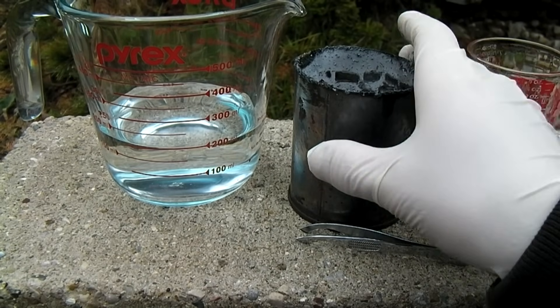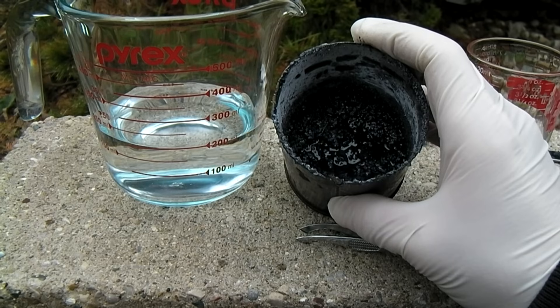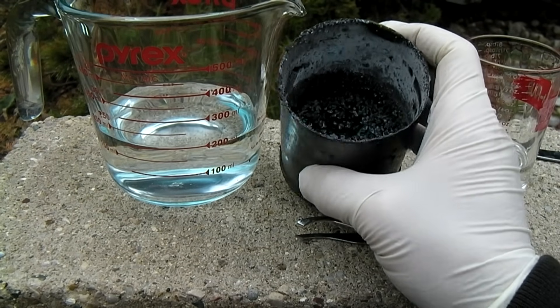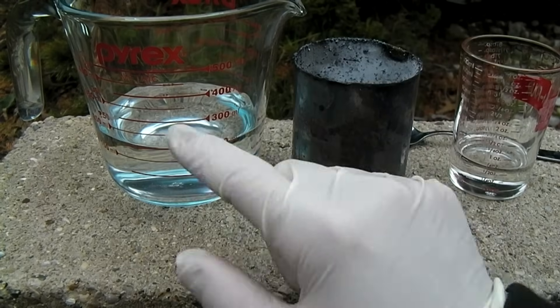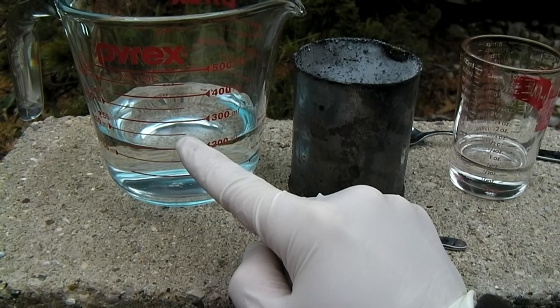In the crucible we now have a mixture of sodium, magnesium hydroxide, and several unreacted products. To separate the sodium out, 200 milliliters of water is added into a container, followed by another 50 milliliters of mineral oil.